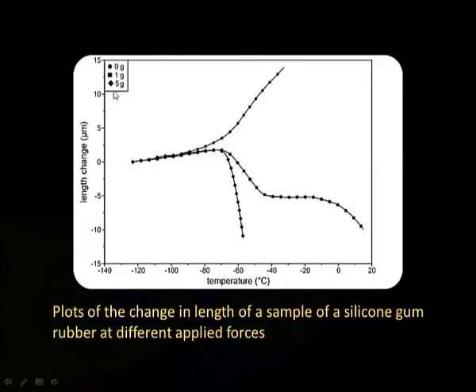Whereas, if the applied force is 5 gram, you can see here that the curve at around minus 70 degrees shows a sharp decrease.